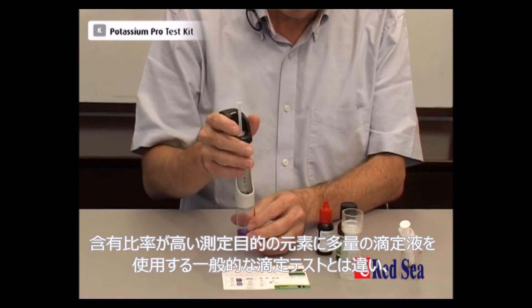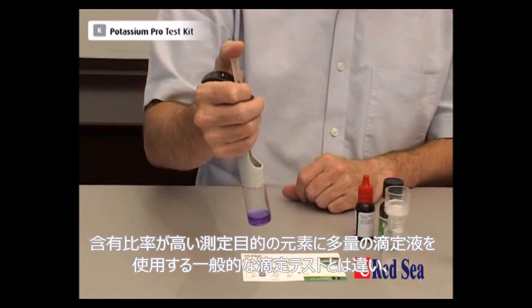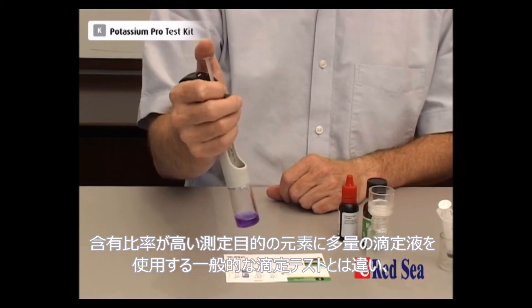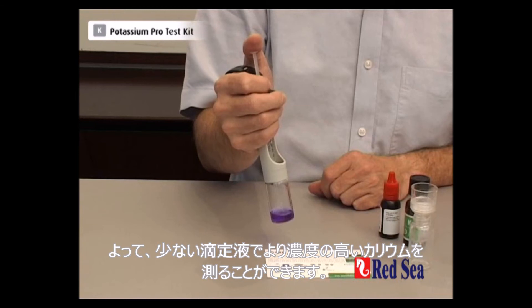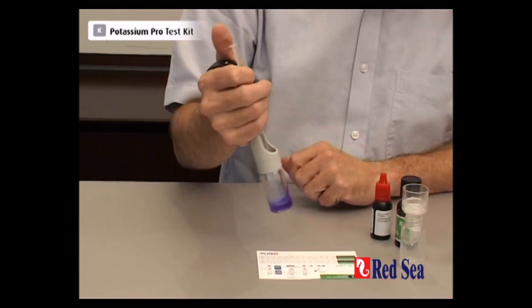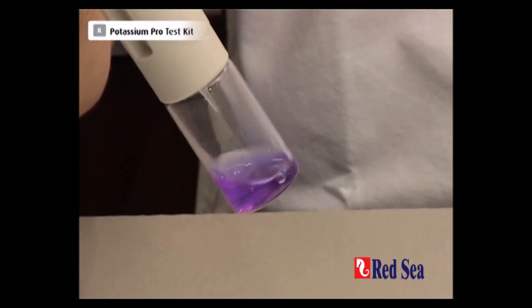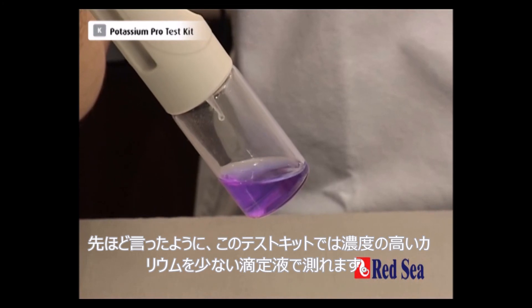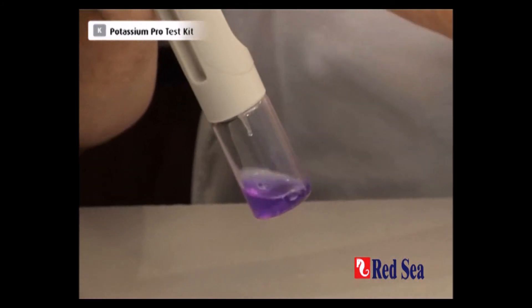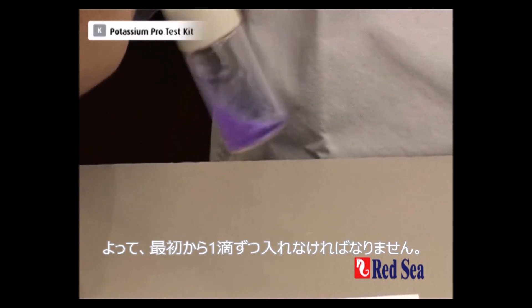Now unlike most of the titration tests you're familiar with, where more titrant equals a higher proportion of the element we're looking for, in this one it's the other way around. We're looking at the less titrant we add, the more potassium we have, so we must add drop by drop right from the very beginning. With this test, the less titrant we use the higher the level of potassium, so we have to do it drop by drop right from the very beginning.